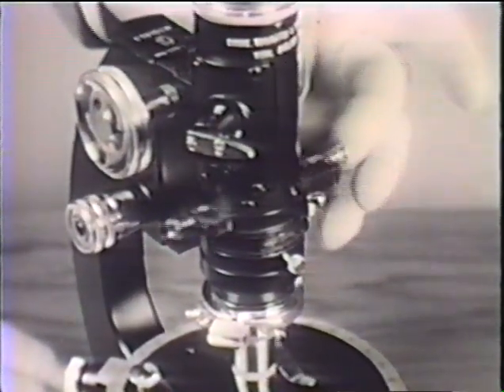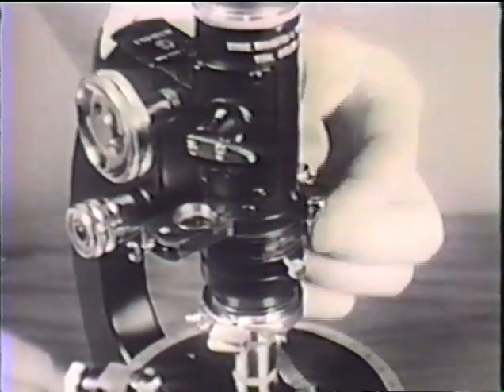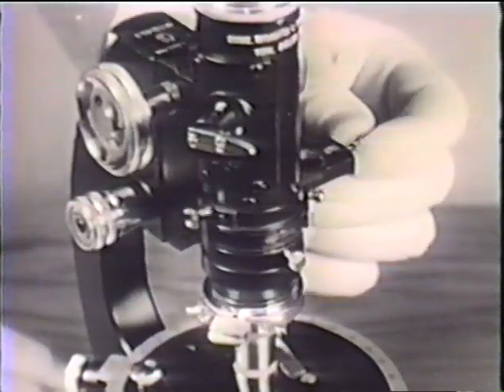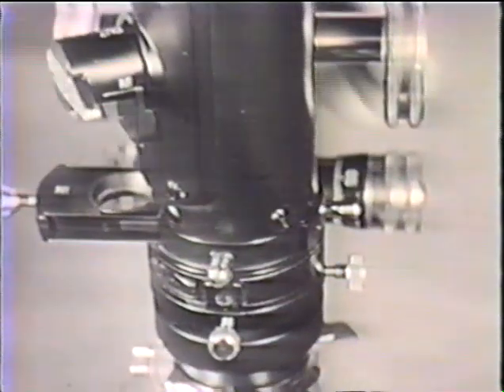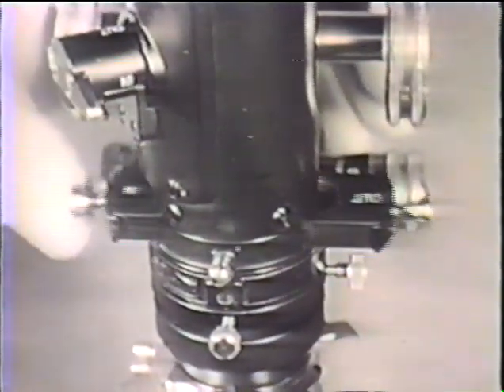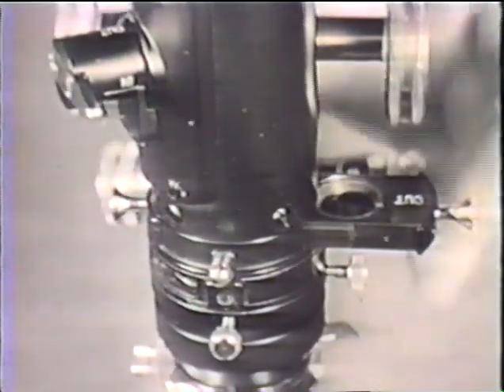Another filter must be placed between the object and the eye to act as analyzer. It is set with its vibration direction at right angles to that of the polarizer so as to extinguish the direct light. It's carried on a slide by which it can be removed from the tube when not required.